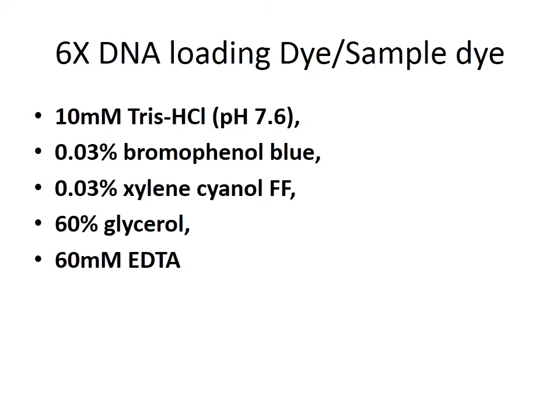So the density of the DNA is similar to the density of the electrophoresis buffer. So when we add the DNA specimen to the well, which contains buffer in it, DNA is not going to settle in the well. In order to settle the DNA solution in the well, the density of the DNA solution should be increased.